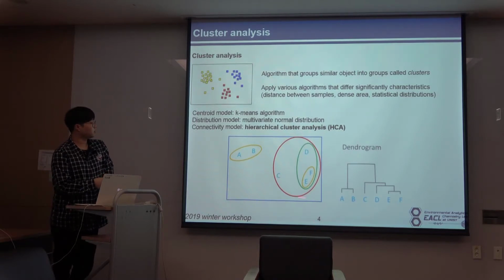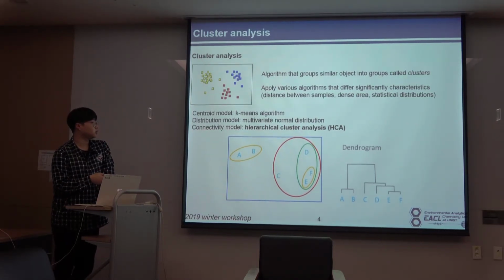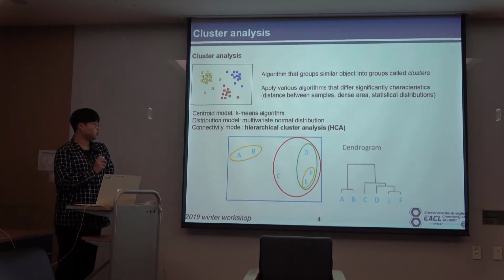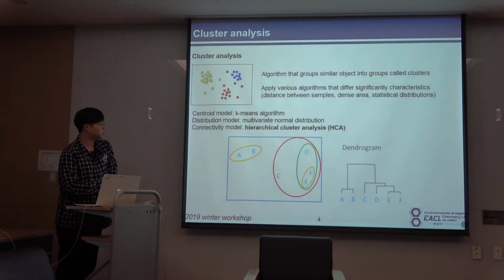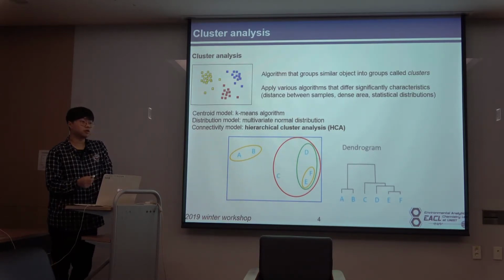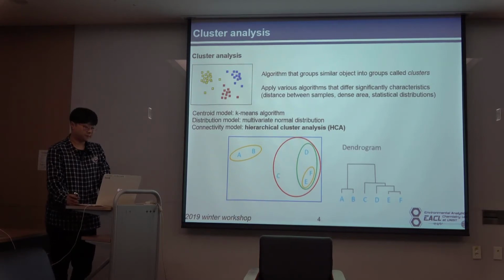So this figure shows the concept of hierarchical cluster analysis. Samples are located based on the distance between samples, and the 2 samples located nearest are combined into one cluster. Step by step, the clusters are combined, and finally one cluster is formed.